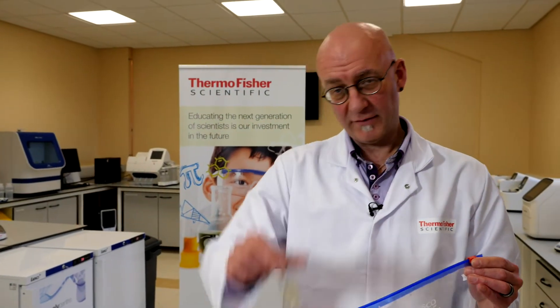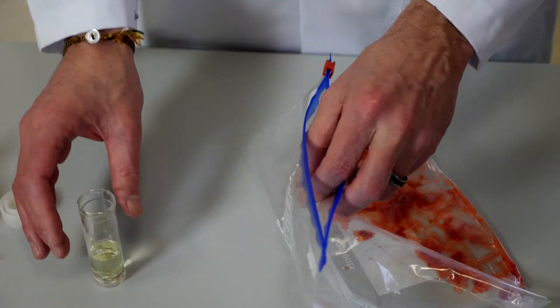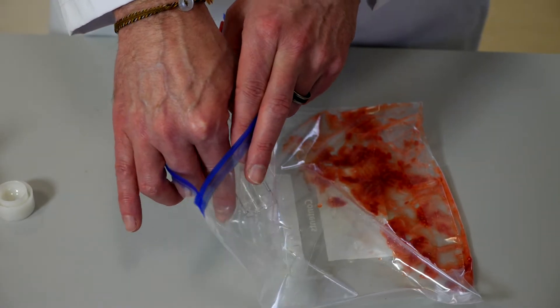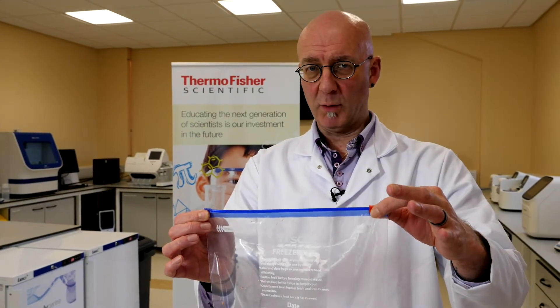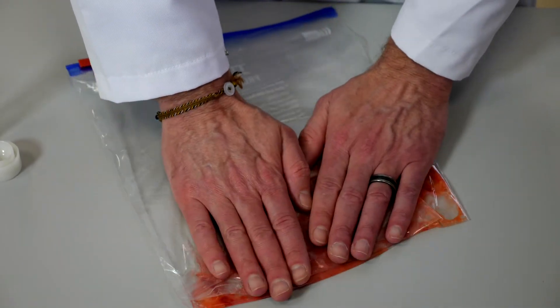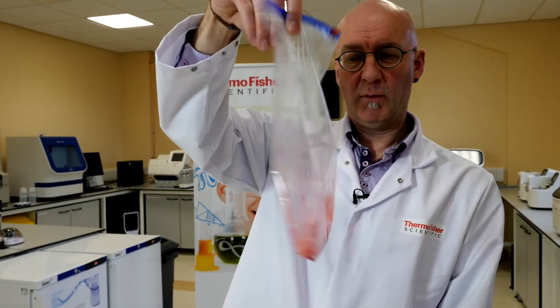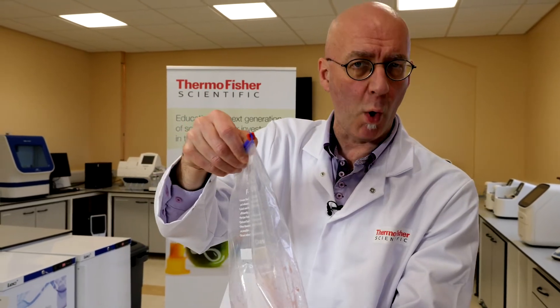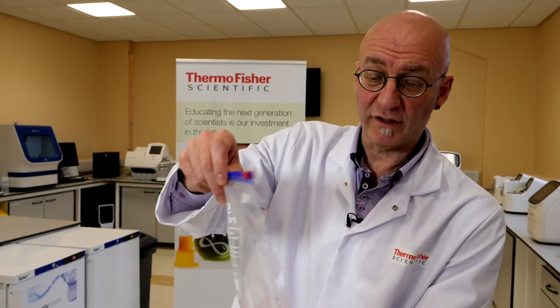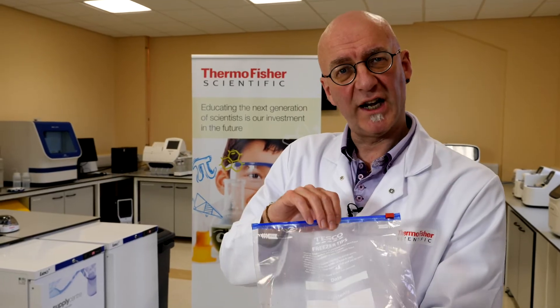We're now going to add the contents to our bag — unzip the bag, open it, take your extraction buffer and pour it into the bag. Remember to zip the bag back up. What we're going to do now is massage this very gently; we don't need to really bash it around. You end up with some liquid and strawberry gunk — the cell debris, the cell wall debris. But we have a solution, and the solution surrounding the cell debris will contain our DNA.